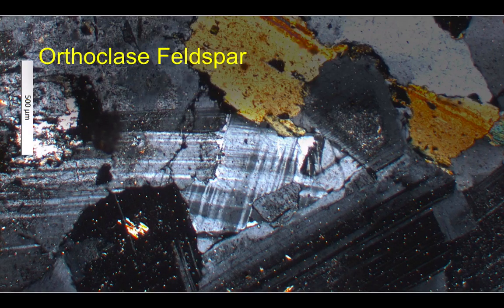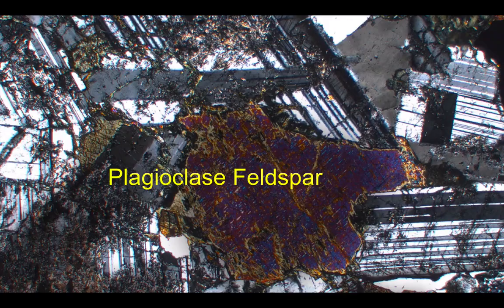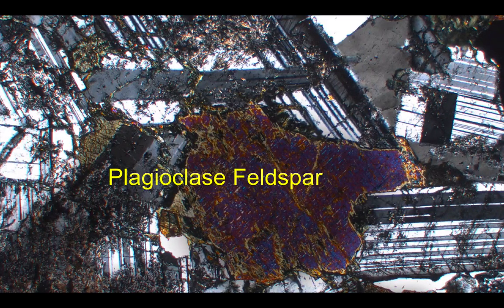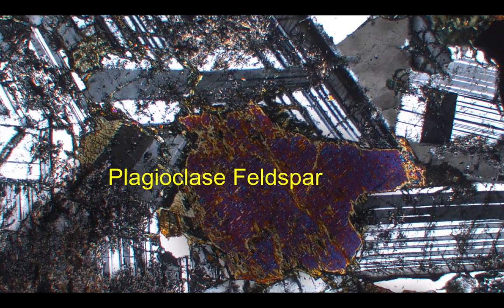We can't see any cleavage unfortunately, but that crosshatch pattern is quite distinctive. In plagioclase feldspar, which are the minerals around the edge of the screen, we can see that the pattern of black and white stripes — or grey and white stripes — is different. These are a bit simpler and a bit clearer. This is perhaps more distinctive of plagioclase feldspar, like in this gabbro, this igneous rock from the Lake District. Again, we can't see cleavage, but we can see this distinctive twinning of crystals.